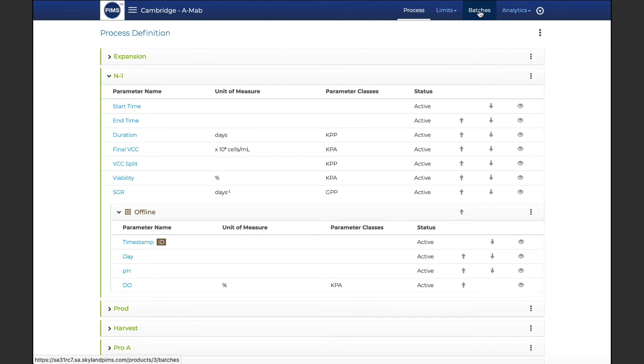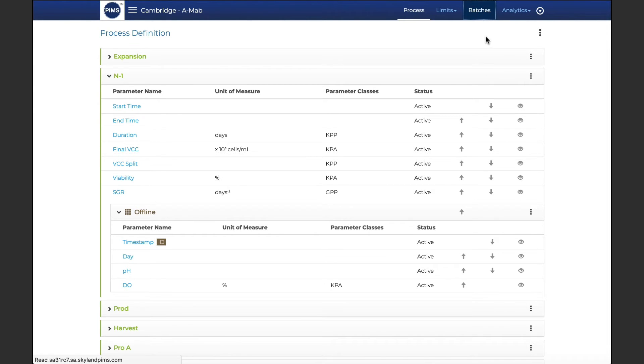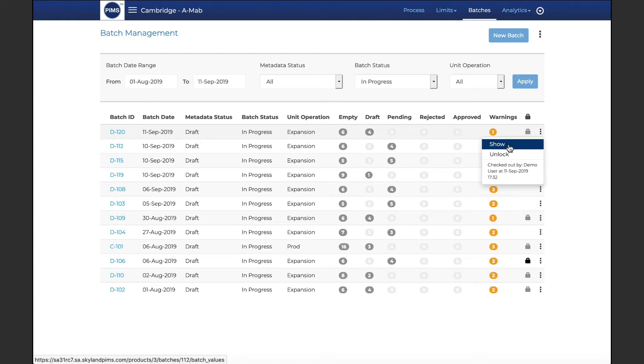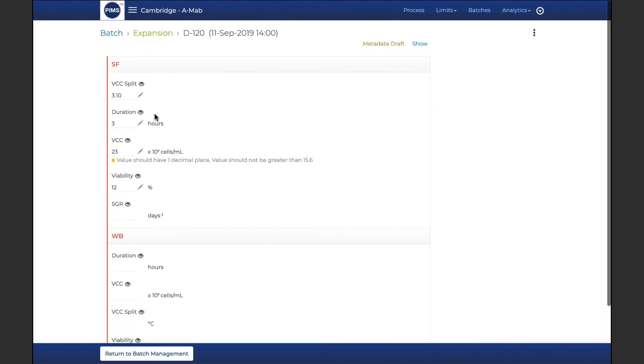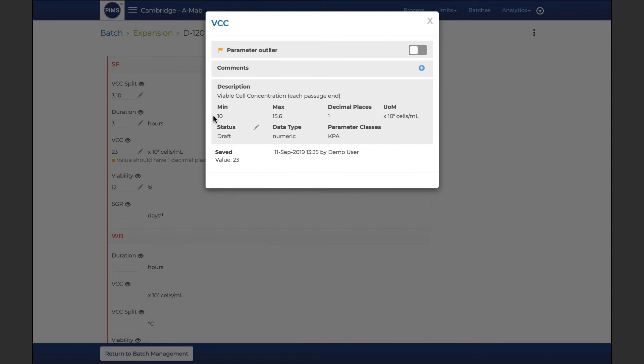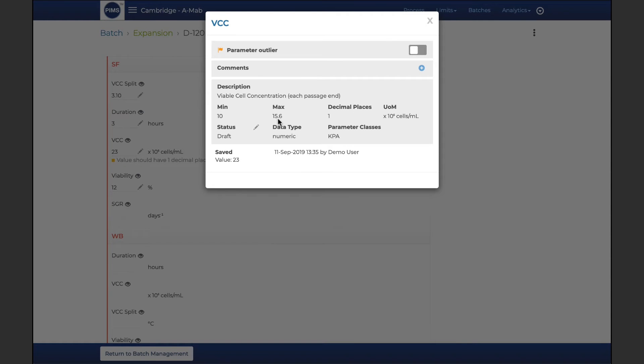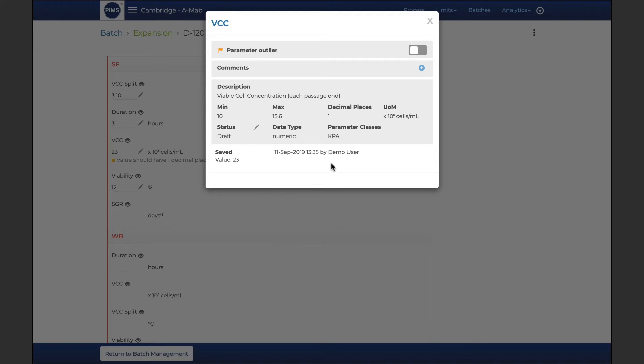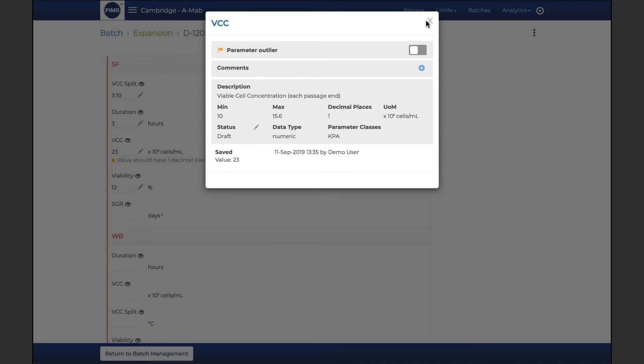PIMS batch provides visibility into the status of all batches for which data has been uploaded or entered. Data entry pages are automatically configured when processes are defined, including expected data ranges for numeric parameters. PIMS tracks the status of each parameter value and enables the submission and approval of results as the batch progresses, and includes a full audit trail to ensure data integrity and accelerate reporting.